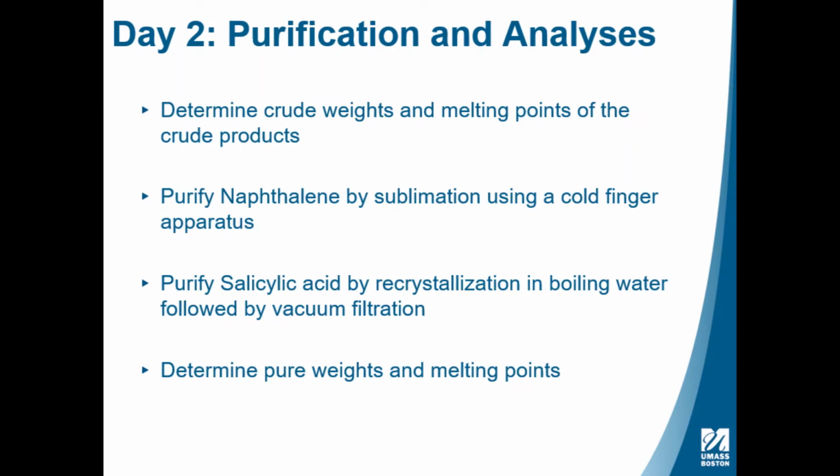On day 2, we will analyze the weights and melting points of our crude products. We will purify the naphthalene by performing a sublimation deposition using the cold finger vacuum apparatus. We will purify the salicylic acid by recrystallization in boiling water, followed by vacuum filtration. Finally, we will determine the weights and melting points of the pure substances.